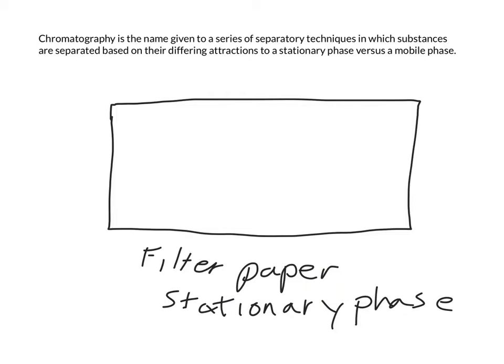In these labs, you'll be taking your filter paper and placing it in a liquid. You'll be using water as your mobile phase in most of these experiments today.